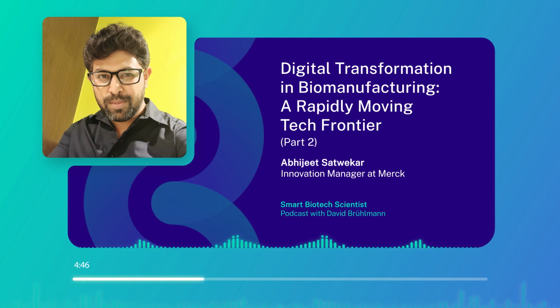Where I see a lot of potential in PAT is in gaining process understanding and optimizing your processes. So how can we leverage that technology? What are the strategies you found the most powerful to do that?